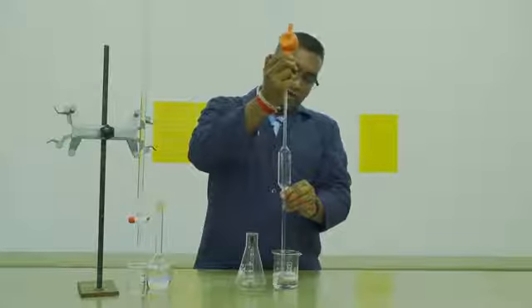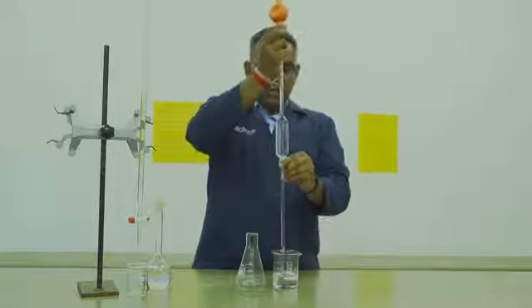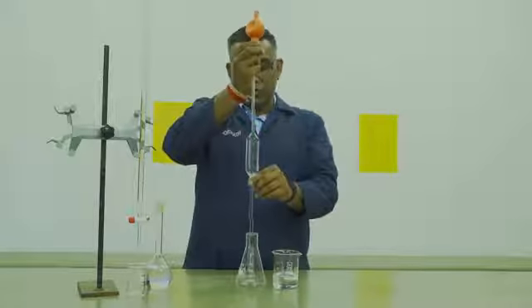Ensure that you do not pass the graduation mark of 100 ml. Once you've got 100 ml in your pipette, you will then transfer it to your conical flask.